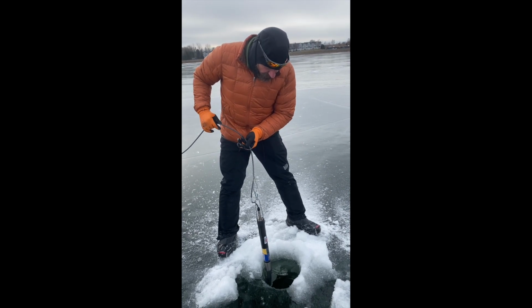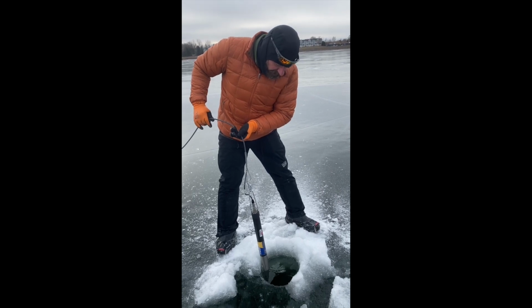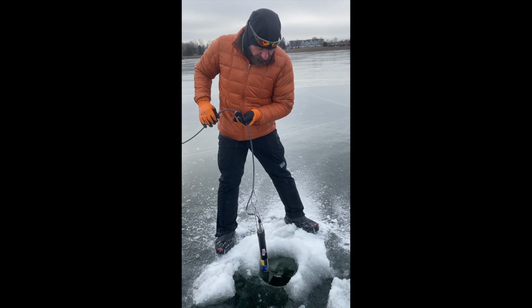Okay, so the temperature sensor is probably equilibrated, and now we're going to do a slow profile, sort of at approximately this speed, all the way to the bottom.